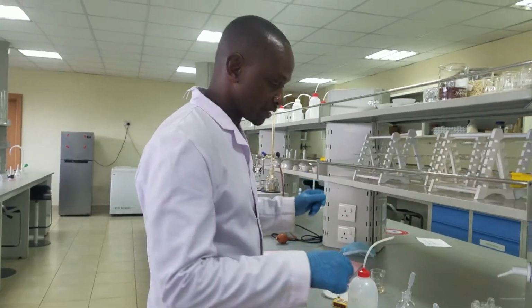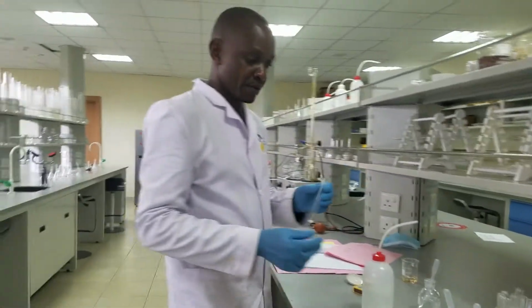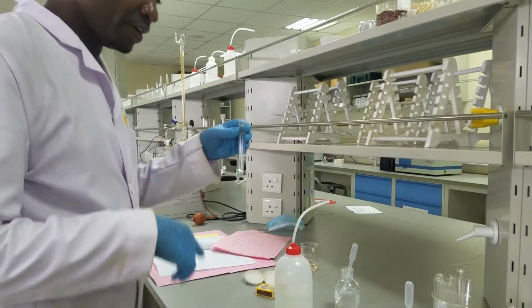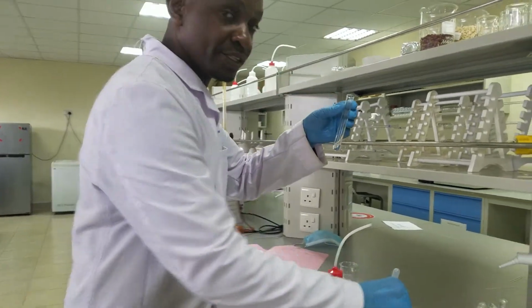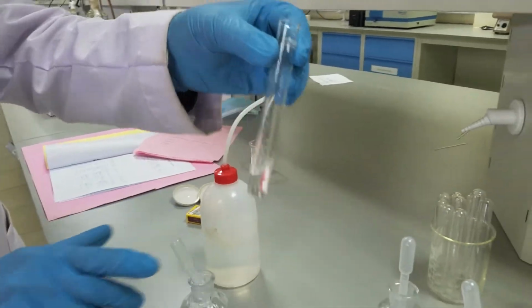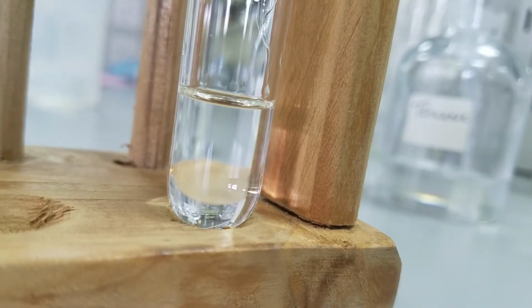I'm repeating the same experiment. I'll start with heptane, and then now, instead of adding water, we are going to add in DCM. Remember, DCM stands for dichloromethane. So, I put it there. Observe whether you can see any two layers.